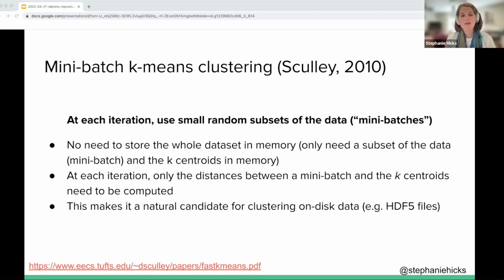So the idea is you load 1% of the data into memory, you update the parameter estimates, you spit that 1% out, you then input the next 1%, update the parameter estimates and spit that out. And you iterate over the whole data set. But the beauty is you never use the whole data at any given point in the algorithm. In that way, you're capping how much data is being processed at one point in time.